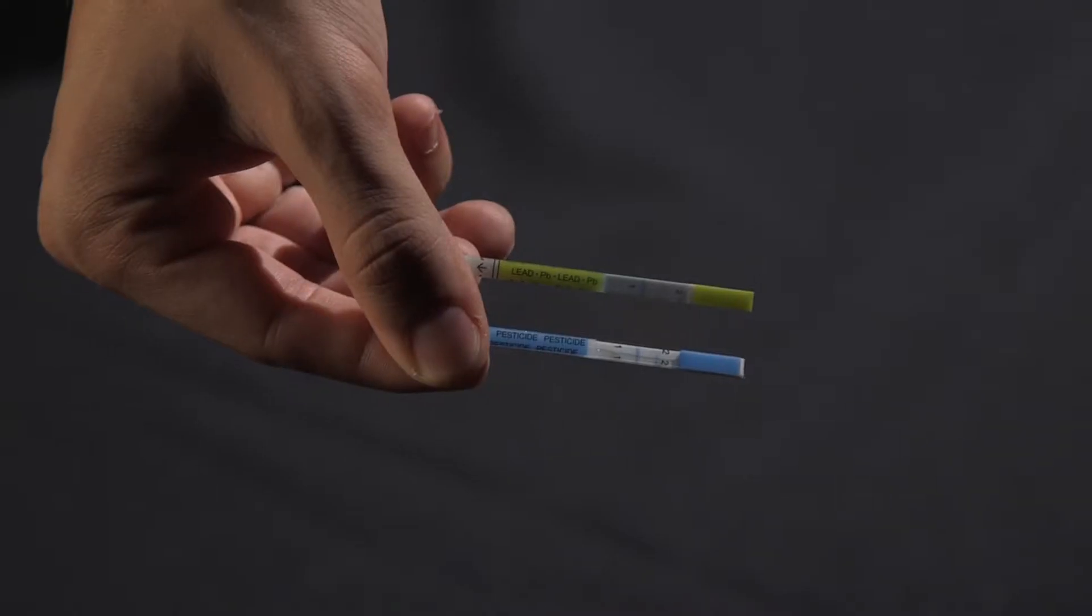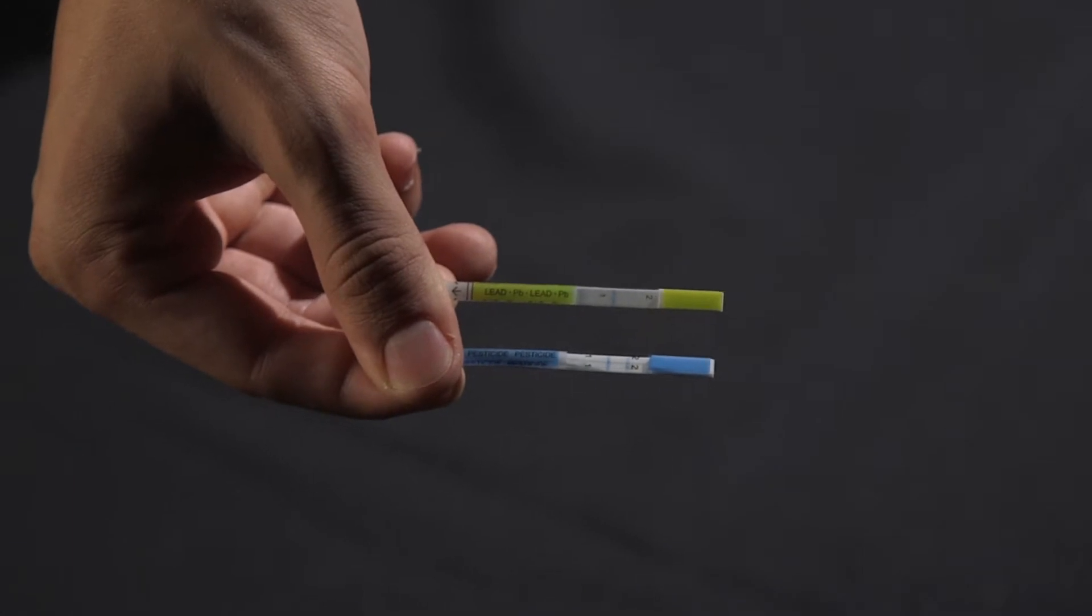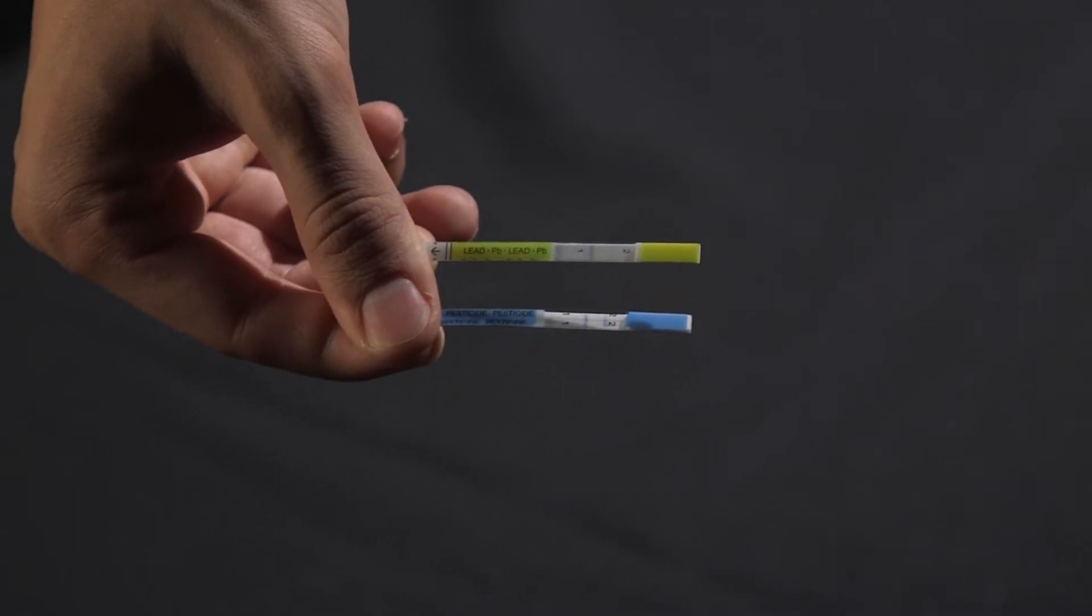After 10 minutes, you'll see the blue lines appear on the test strips. Grab the sheet of paper containing the test result charts and compare your test strips to the illustration.